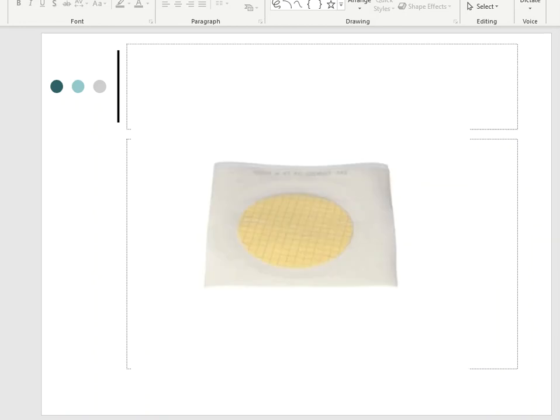Here's another picture of a membrane filter. These are kind of super clean. They're packaged individually instead of in cases or in boxes. And you would actually take one of these out and peel the backing off of it. There's going to be a piece of paper on the top and a piece of paper on the bottom, most of the time. And you will throw those little pieces of paper away and use that whitish, plasticky, flexible membrane filter in the middle.